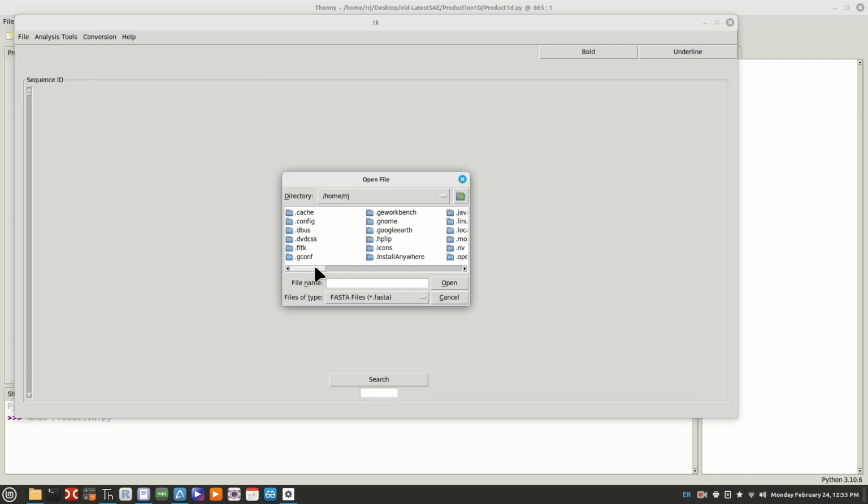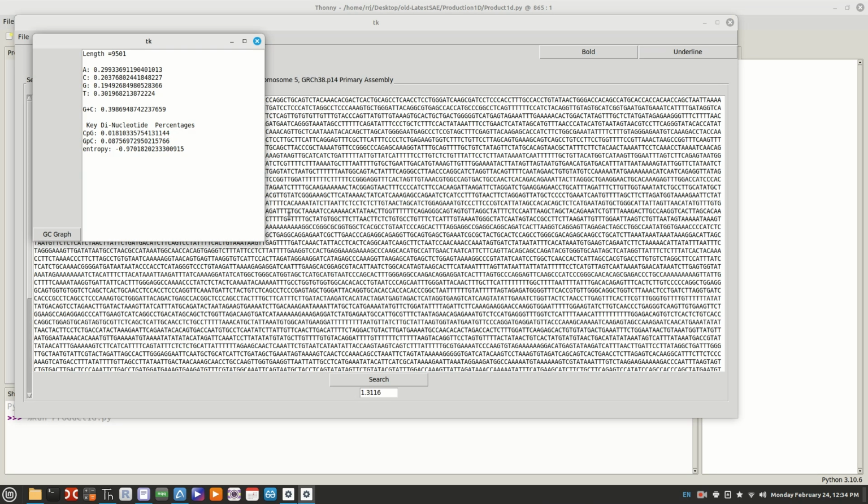I am going to open a local file. Let's start with, let's see, where did I put this? Desktop. And I put it in our class, Spring 25 FIFO, Project 1. And here are two. So let's do the long one, which is GPX8. We'll do that one first. GPX8.